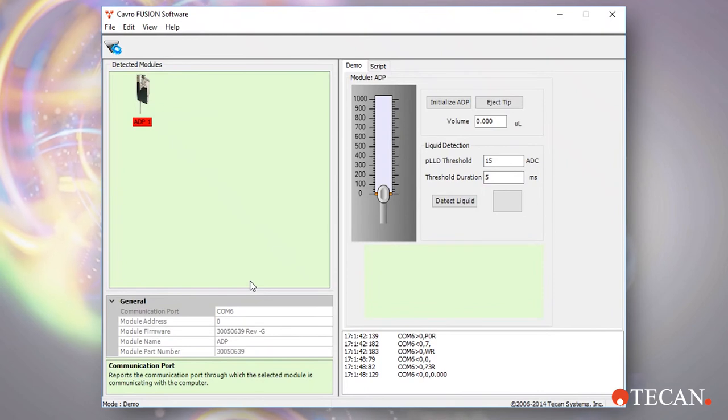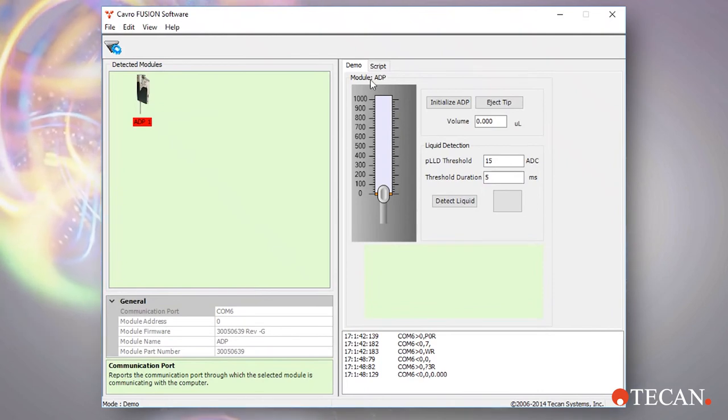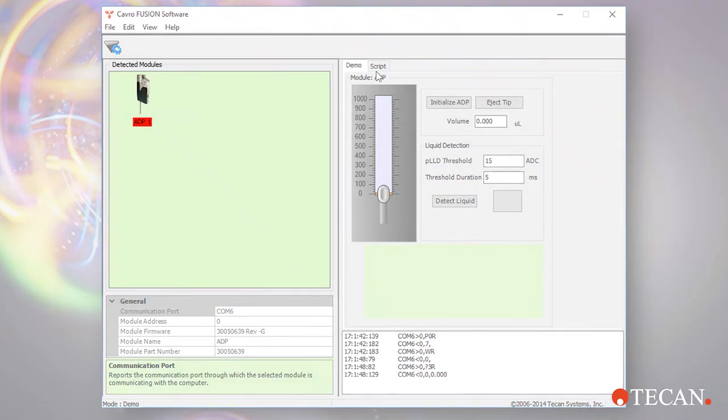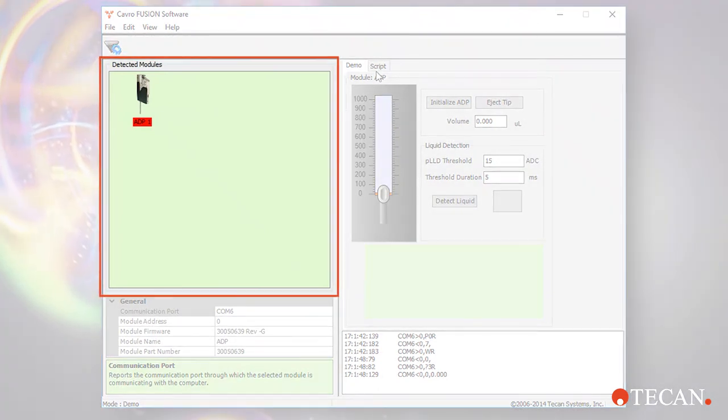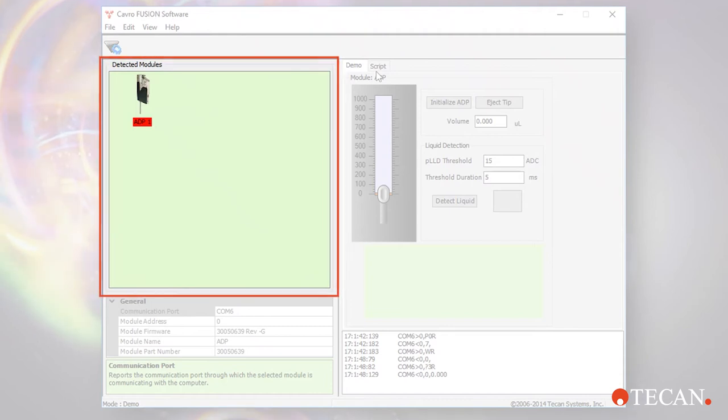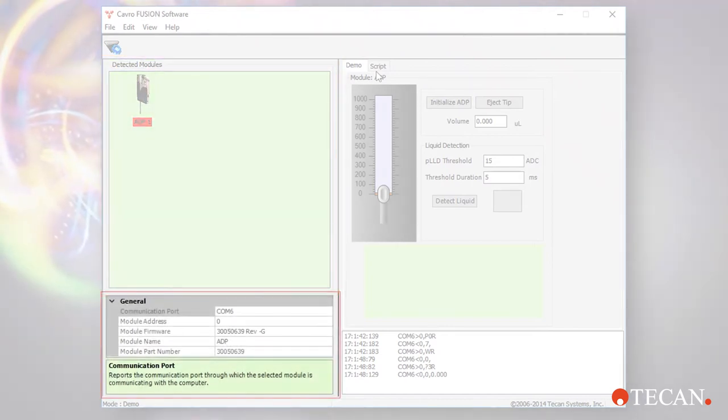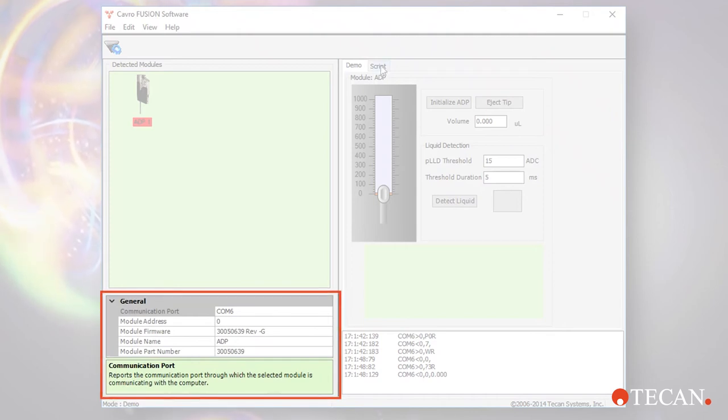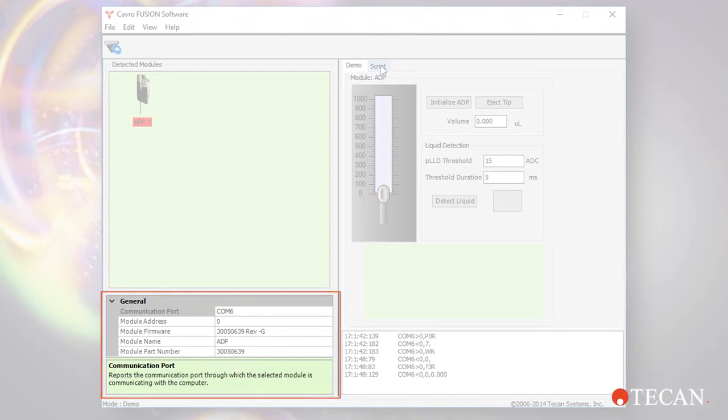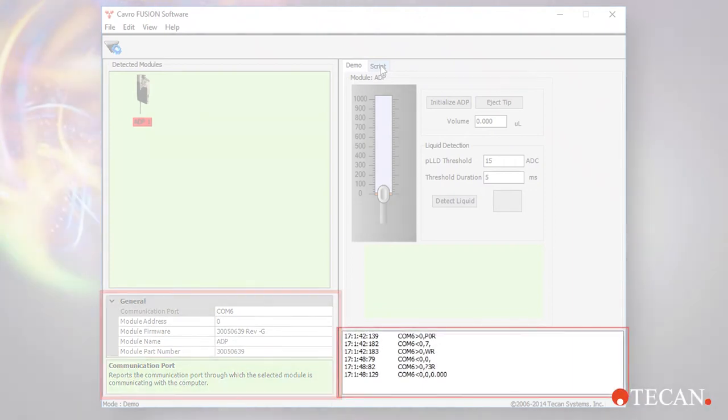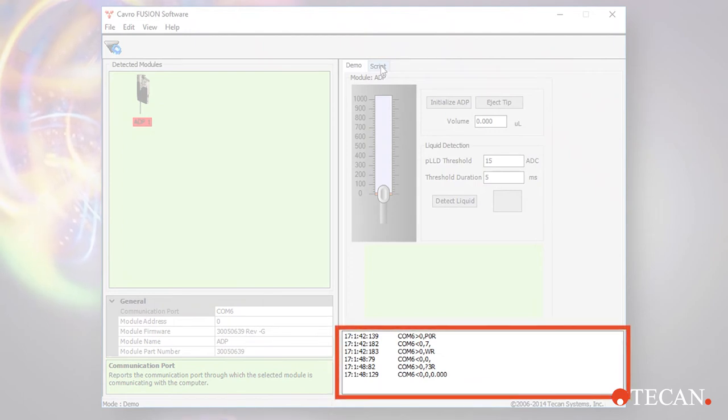The CAVRO Fusion software window includes four panes. The detected modules pane at the upper left displays all CAVRO modules connected to your computer. In this video, just one ADP. The properties pane at the lower left displays information about the currently selected module, such as the COM port, device address, and embedded firmware version.